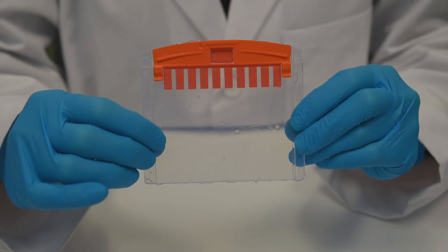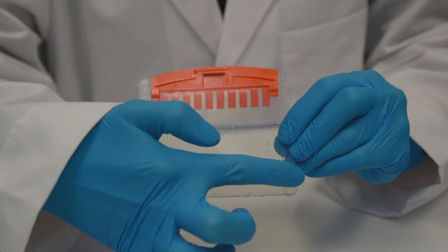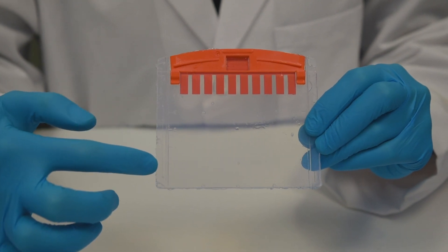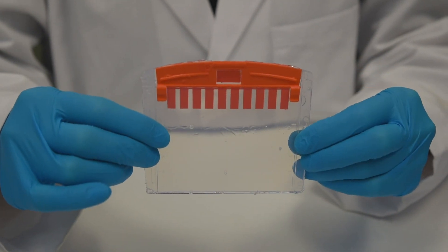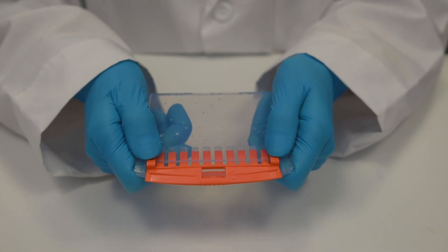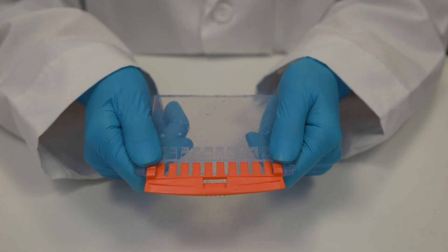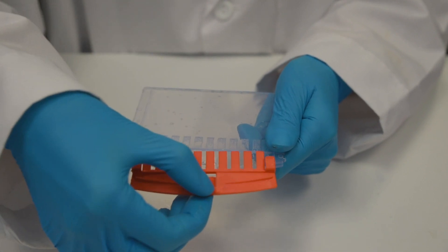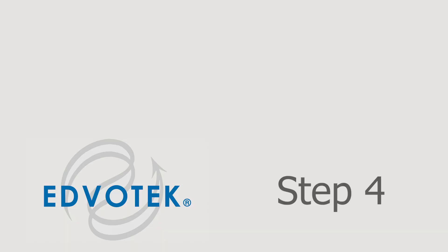Step 2: Some gels may feature a sticker or tape at the bottom of the front plate. Remove the tape if present to expose the bottom of the gel. Step 3: Carefully remove the comb by gently pulling upwards. Pull the comb straight up to prevent damage to the wells of the gel.